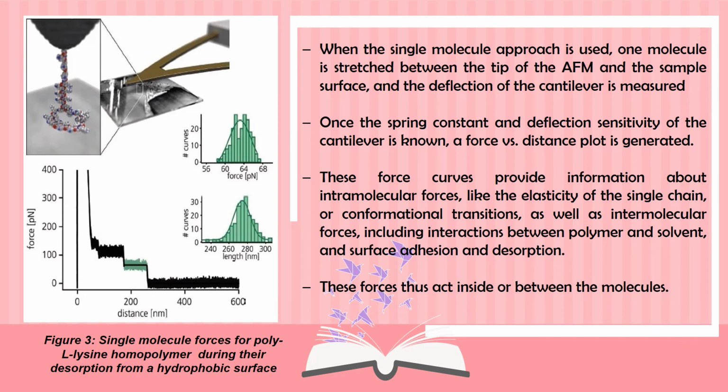Conventionally used cantilevers apply a force that is high enough to cause deformation in polymers, which have a modulus range from kilopascals to a few gigapascals. When a model is used to examine the indentation of the sample by the tip, data is generated on the elastic and viscoelastic characteristics of the sample at nanoscale.